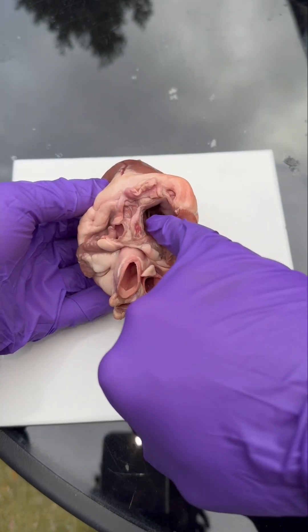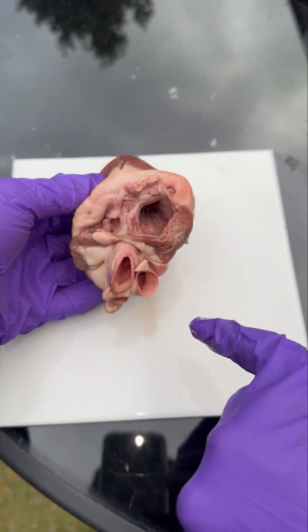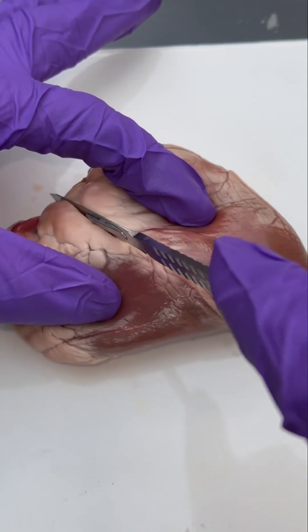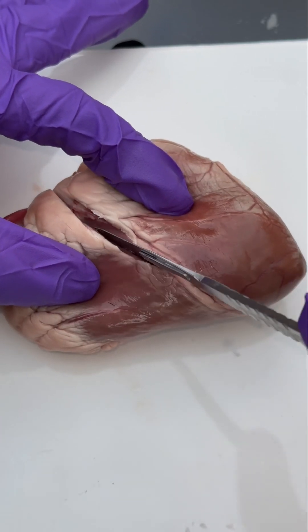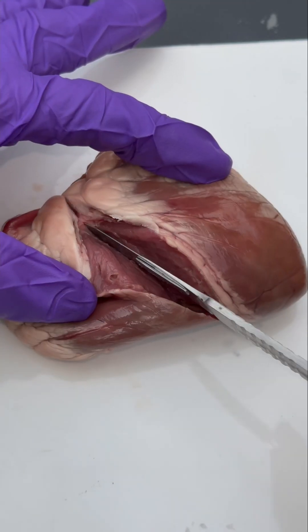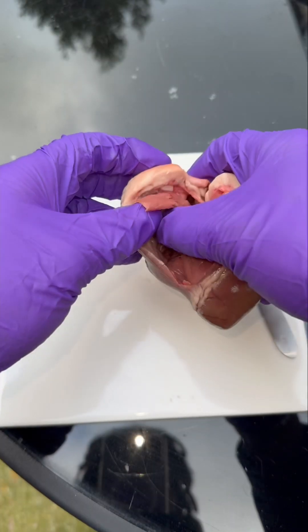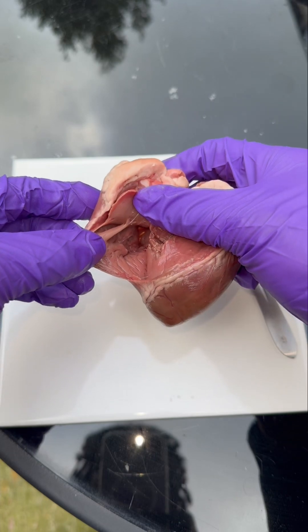At the top we have the vena cava. This brings all of the deoxygenated blood back into the heart. The vena cava brings deoxygenated blood into the right atrium of the heart, and the atrium then contracts and sends the blood into the ventricles. The ventricles contract and send the blood through the pulmonary artery to collect oxygen from the lungs.